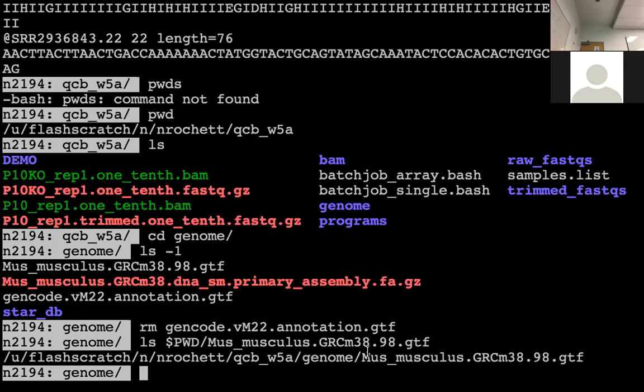Yeah. It's going up. Yeah, I saw the video. Yep. So yes, I had not realized, but once you have installed pip yourself, you still need to fix something. It's just a standard directory, but it's not actually using it.